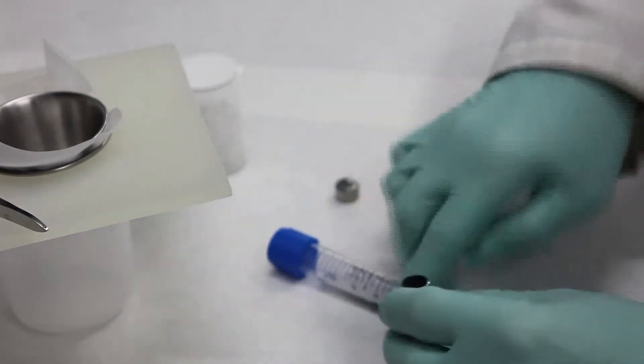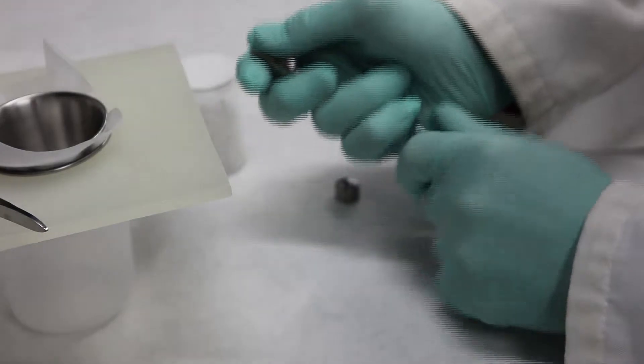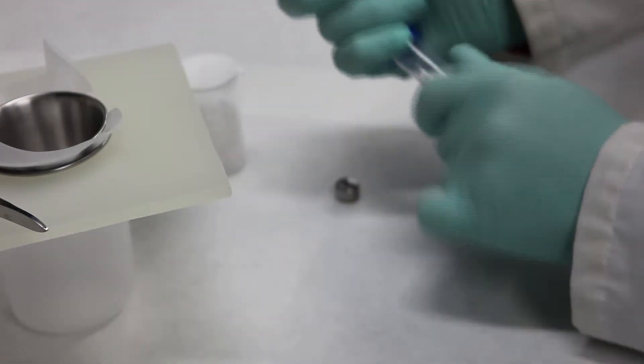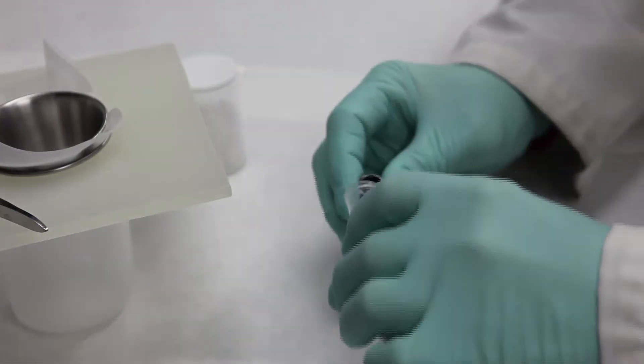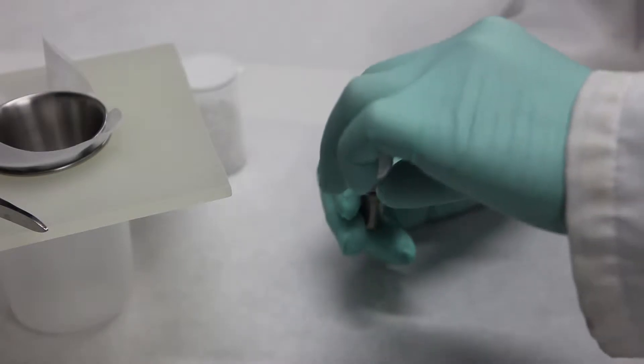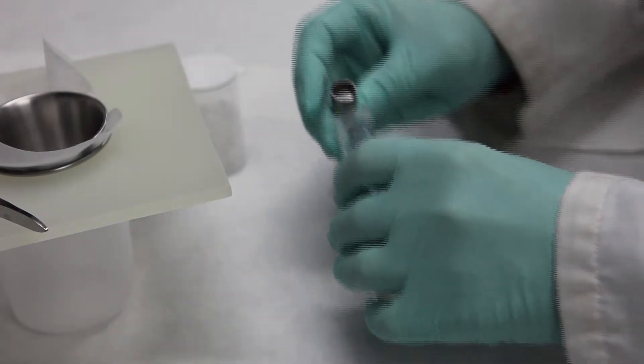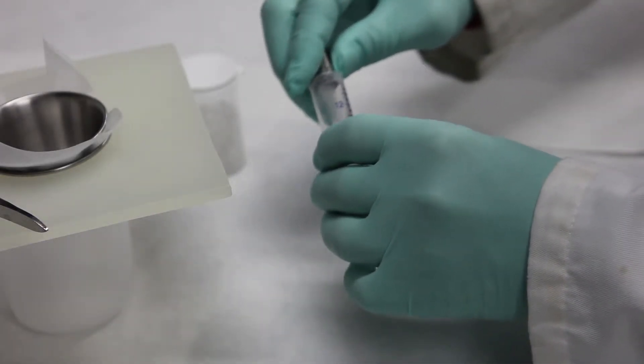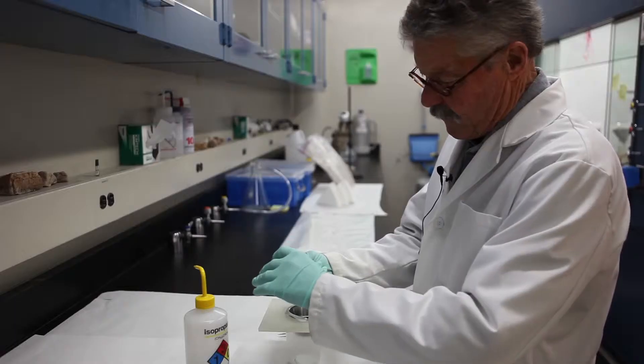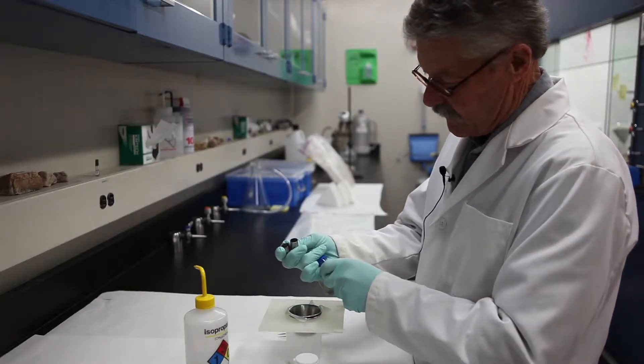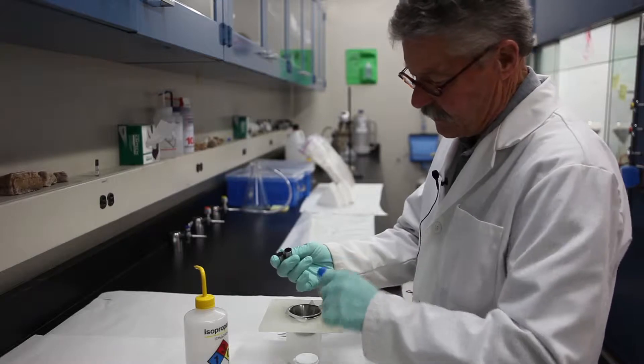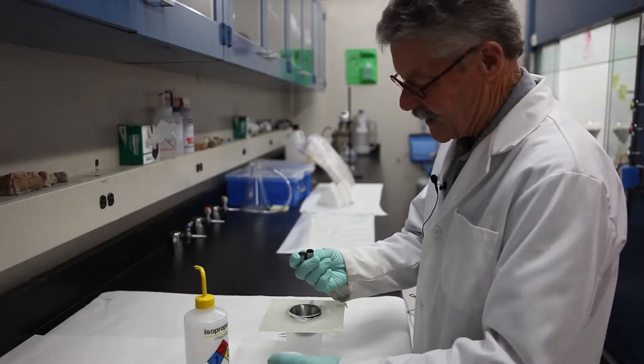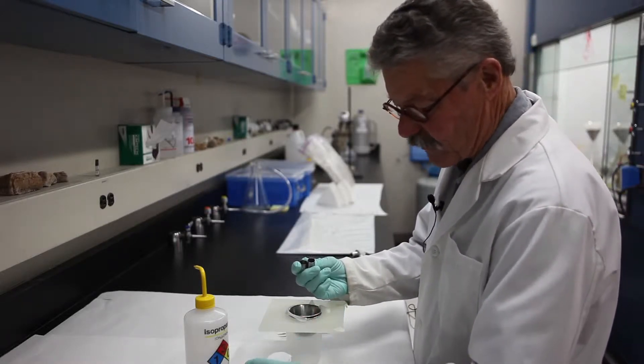Next, we're going to take the sample and pour the sample into it. That's a little too much, so we're going to pour it back. We want to make sure that the amount of the sample and the acrylic BBs do not exceed 50% of the volume of the capsule, otherwise the BBs will not have the opportunity to do their work.